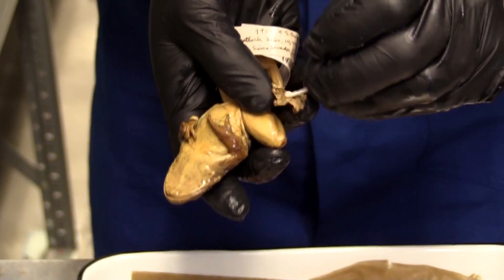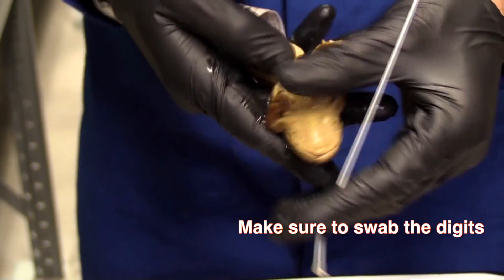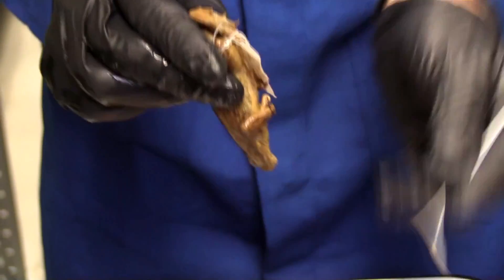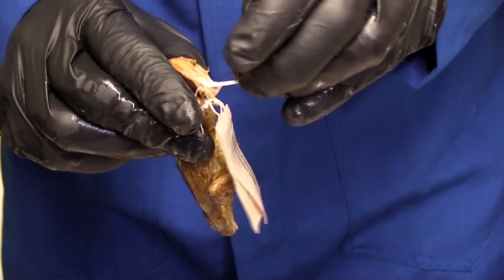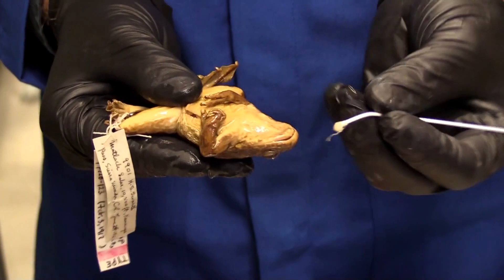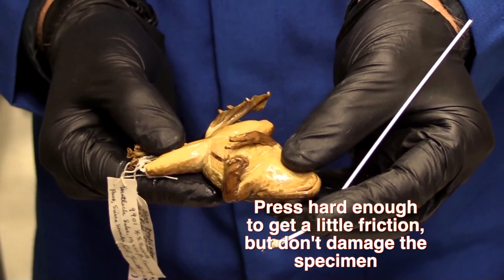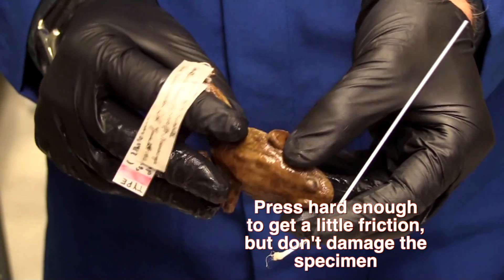Finally, I'm also going to do a little bit in the webbing of the back feet. Notice the little hairs on the swab are actually pulled out — that's actually good, because it means I've been getting a little bit of friction on the animal. And if you look at the animal, it still looks perfectly fine; I haven't ripped the skin or anything.